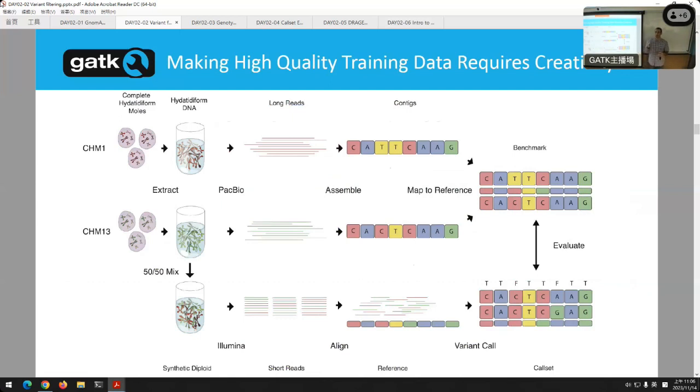Okay, so that doesn't mean it's easy to do variant calling, but it's a lot easier to do variant calling on a haploid genome than on a diploid one, because anytime we see a heterozygous SNP call, we know it's not real. We know there's some error there. So you can throw all those out. And that's why you have those confident regions. We say these are regions where everything is always homozygous, reference or variant. And anytime we see a lot of heterozygosity, we say, let's ignore this region. It's a bad region in the human genome.